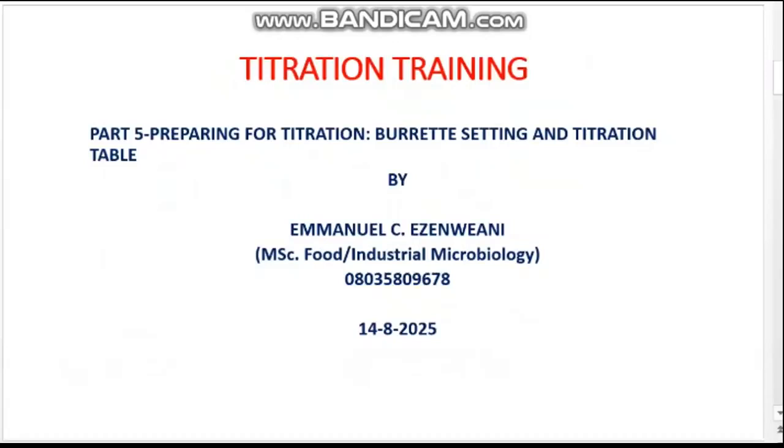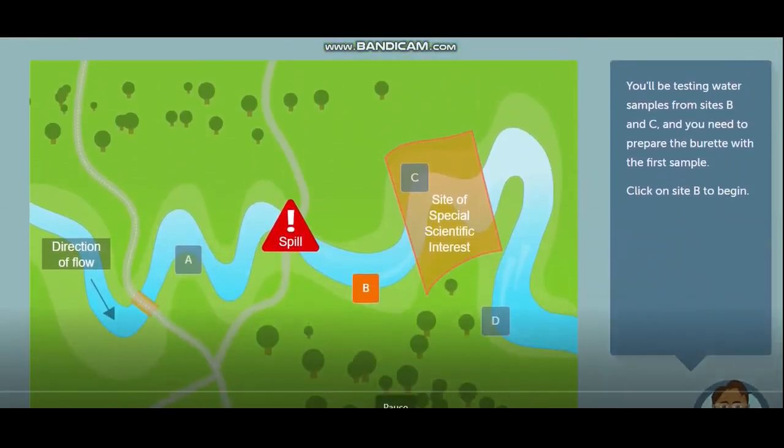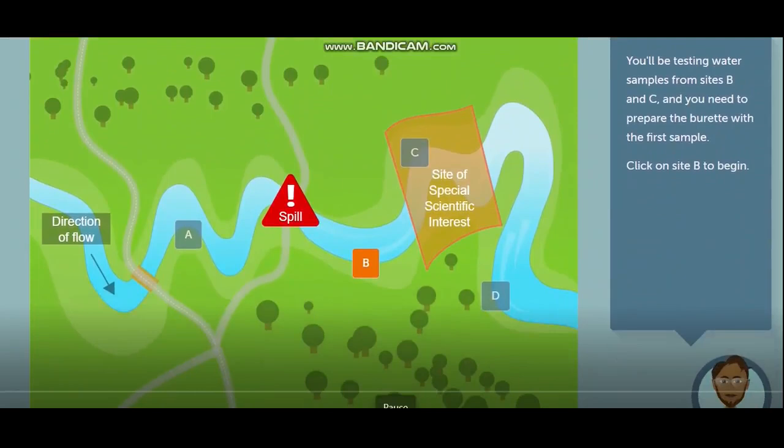You are welcome to part 5 of this titration training, which is focused on preparing for titration. Our objectives are filling and burette setting, burette reading, and titration table. This task focuses on setting up the burette.